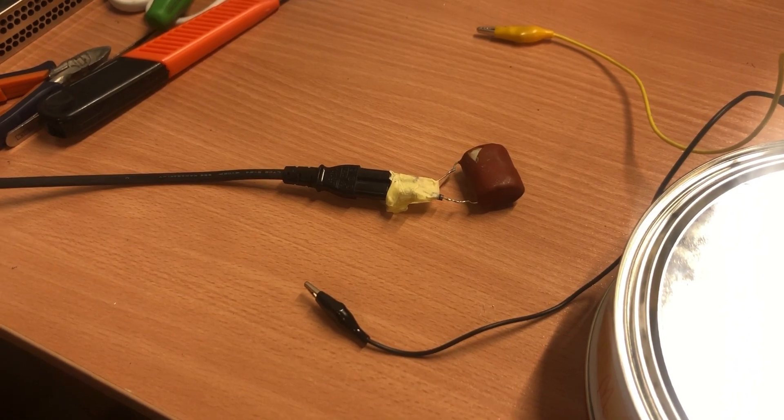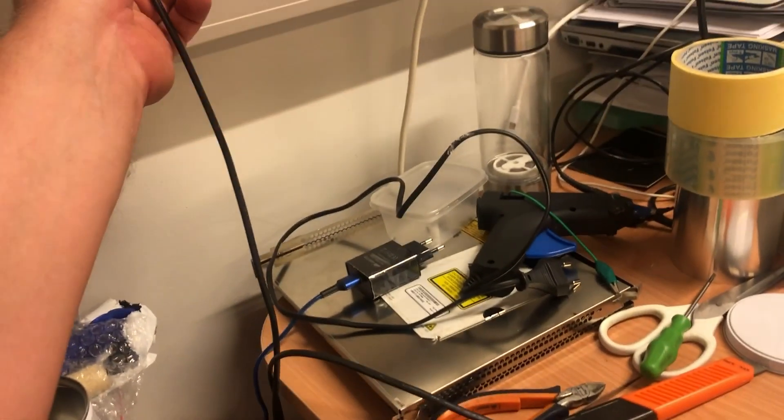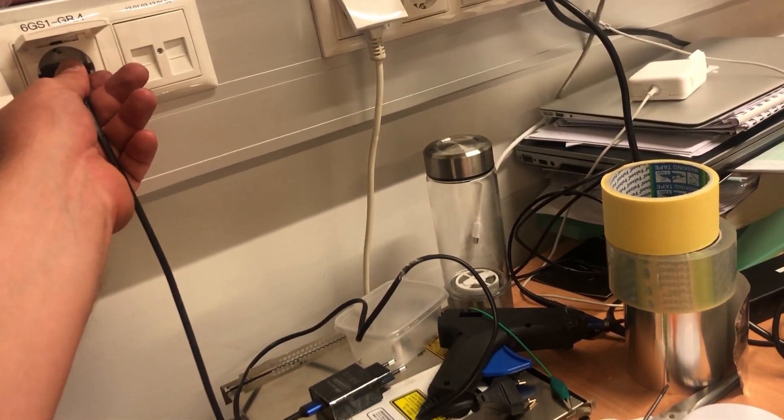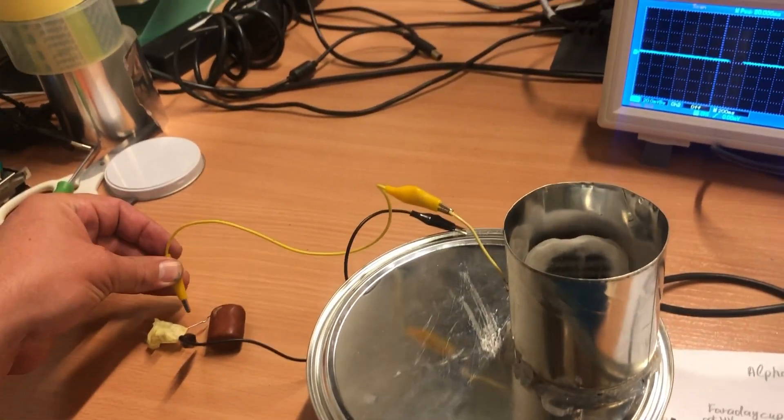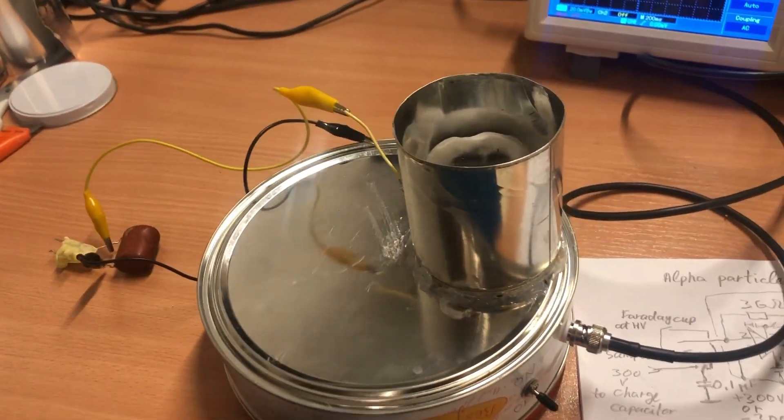Capacitor is charged to 300 volts by connecting to 220 volt mains. And after charging it is carefully connected to the Faraday cap.